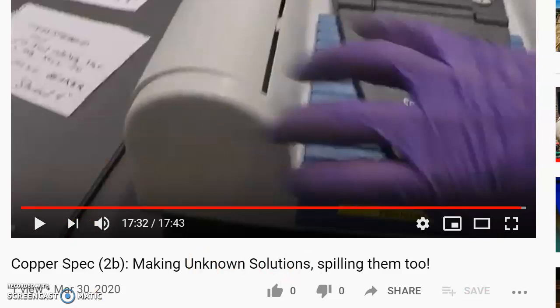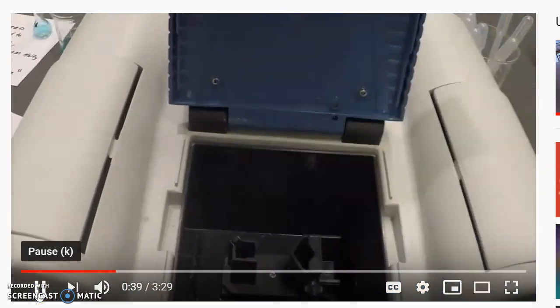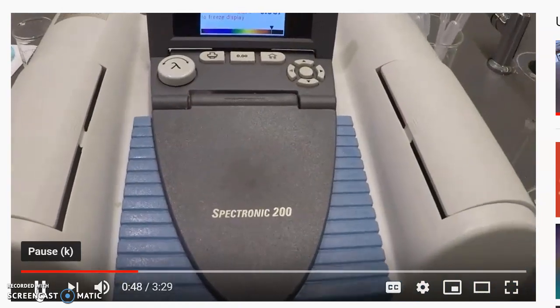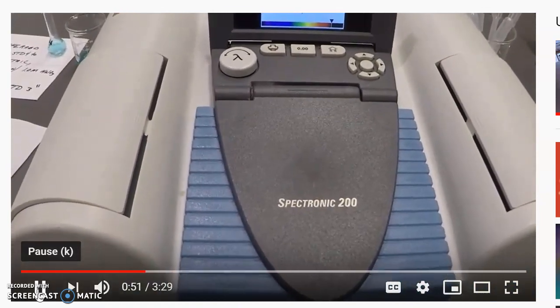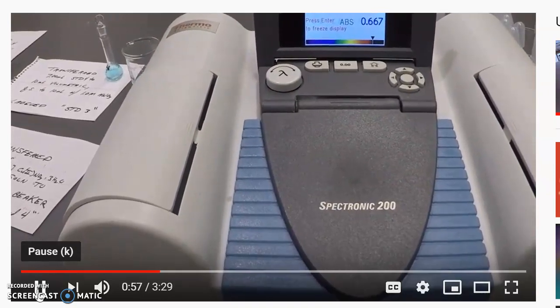Okay, and we have 4 minutes left in this video, so let's see if we can finish it up. Oh, here we go with the absorbances. So there's the 0.667, and I just read you those.